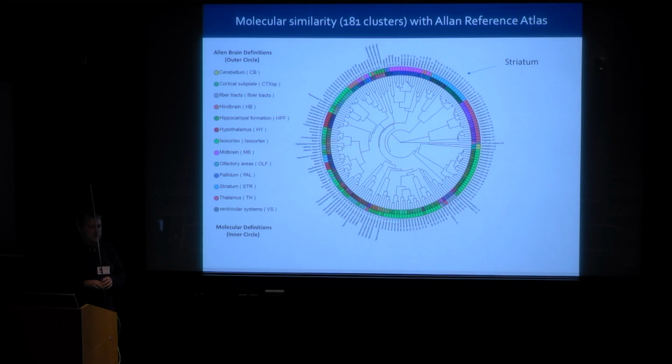Yeah, I think in many of those connectivity things, you have to have a higher density of the measurement to be able to pin down a single neuron that connects different parts of the brain. So obviously that would be fantastic. As I said early on, the sensitivity of these subcellular arrays is not there yet. So that will only look for the biomarkers, the top biomarkers. But I think that's a super good potential to do in the future.